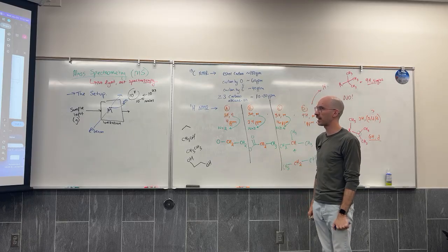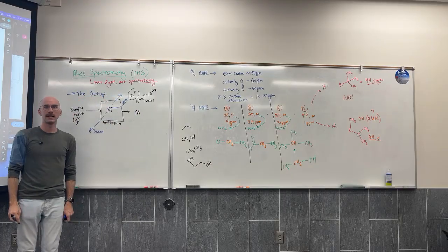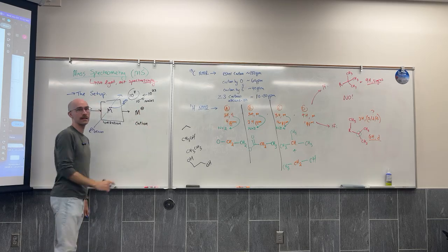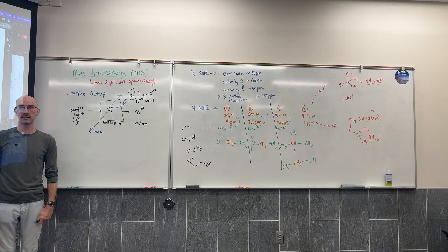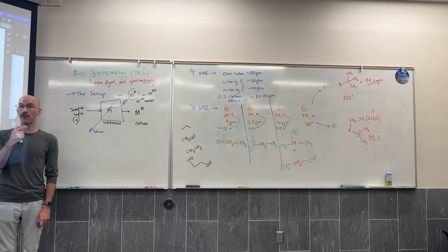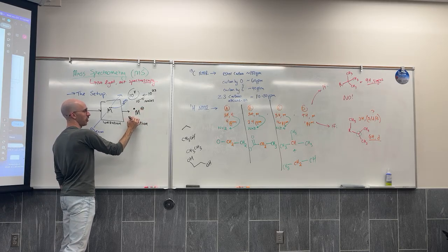What happens after an electron is removed? My molecule now has a positive charge. It's a cation. Why? Because I just lost an electron, so my balance of positive and negative charges is now off. Plus, in my molecule, every electron was paired, and now I will have lost the pair to one of my electrons. So it is also a radical.